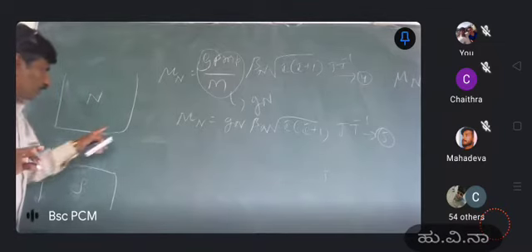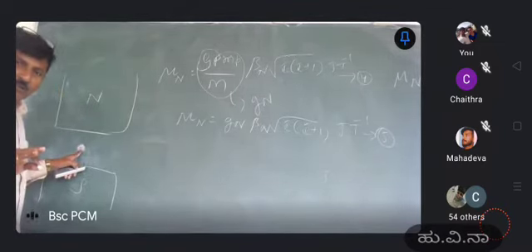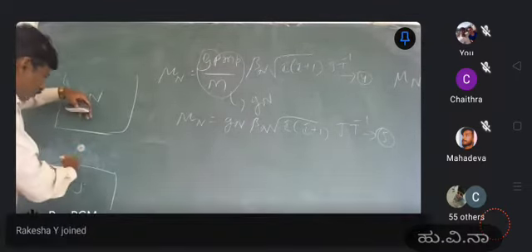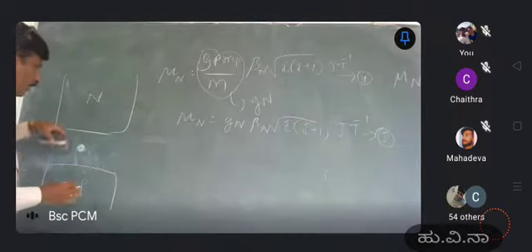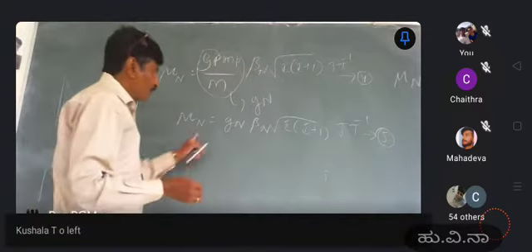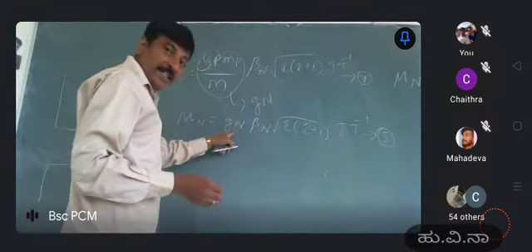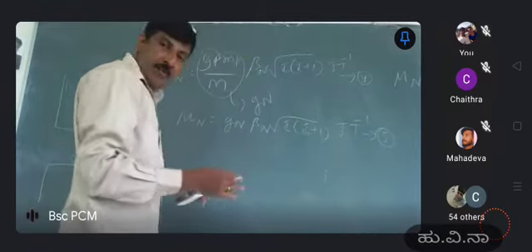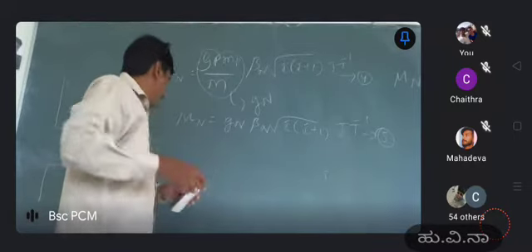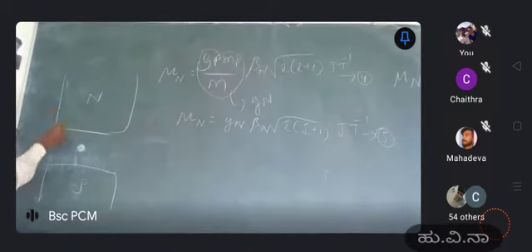This is the strength of the magnetic field. Again, I am going to write this nucleus as another magnet. It is kept inside one more magnetic field. What happens if I keep this magnet in the presence of another magnetic field? It is with respect to that magnetic field direction. The magnetic field direction starts from north to south. This is the direction of the applied magnetic field.